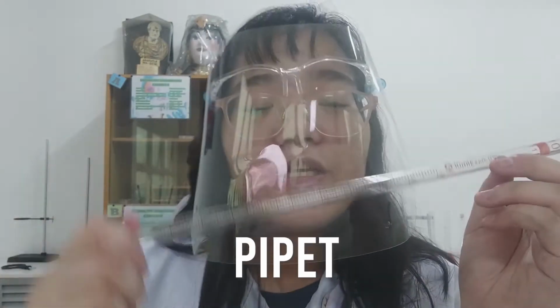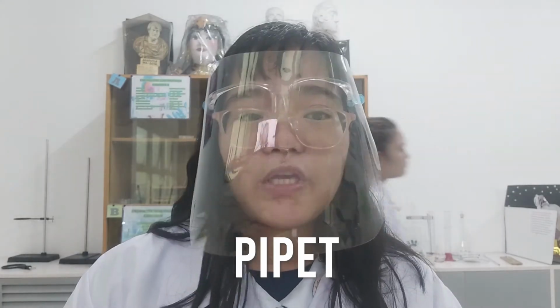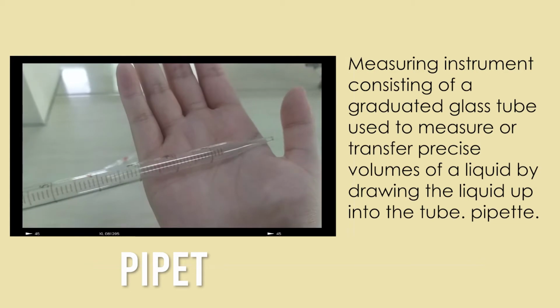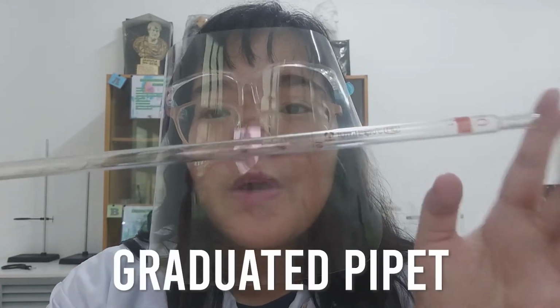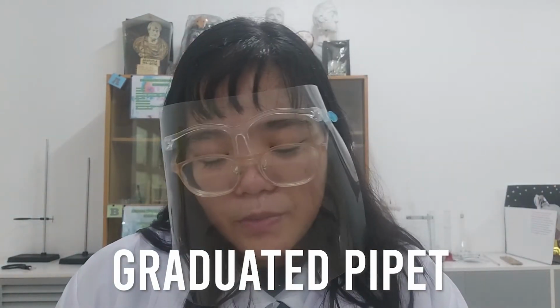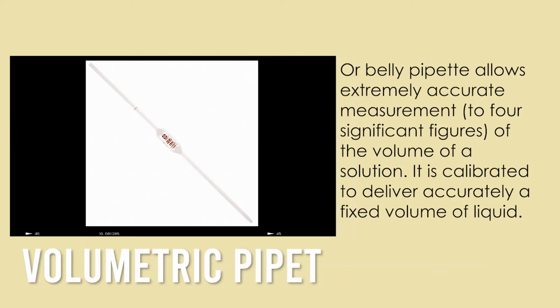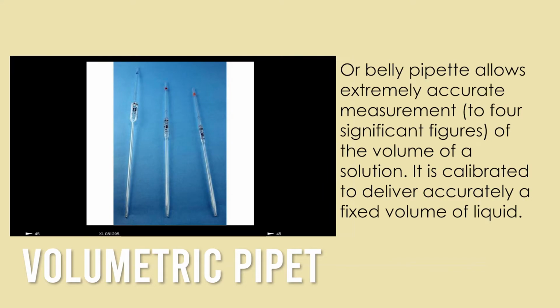One cannot go wrong with the next item of ours, and that is called the pipette. The pipette is actually essential in measuring specific volumes and is used in conjunction with the pipette ball. There are actually three kinds of pipettes, and this one that I'm holding right now is called graduated pipette, which can be used in any of the given markings along its side. The second one is the volumetric pipette, which is extremely accurate, but it is only used for one volume.